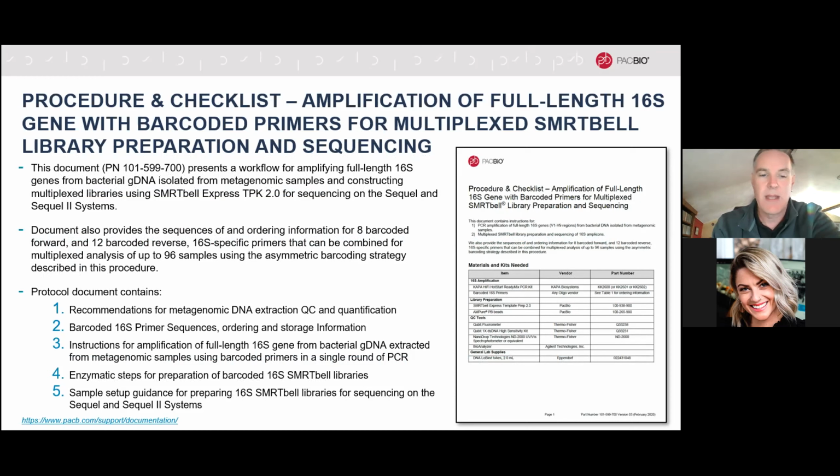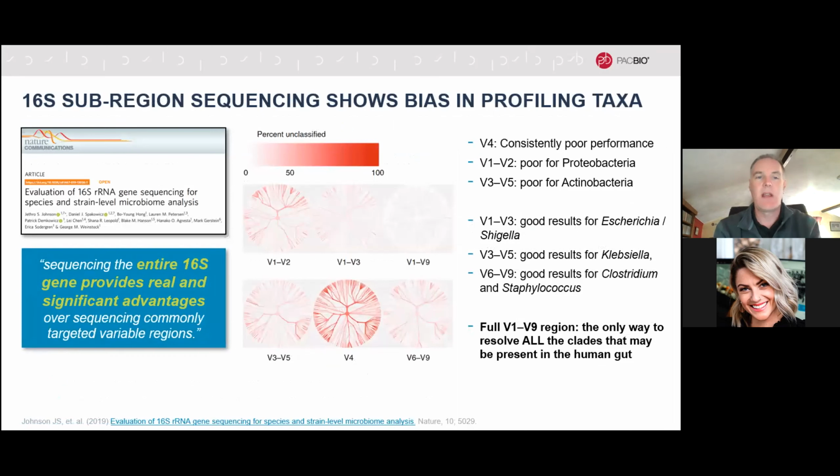So a little bit of information here about 16S sequencing. Traditionally, I suppose, is the word, using short reads. You have a 16S region of about 1.5, 1.6 kb, which is out of range of a lot of the shorter read next-gen technologies to read right through. Likewise, even for Sanger sequencing too, it's a little bit out of range to go through.